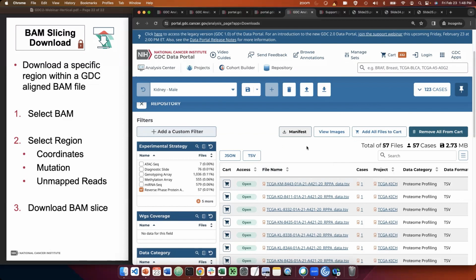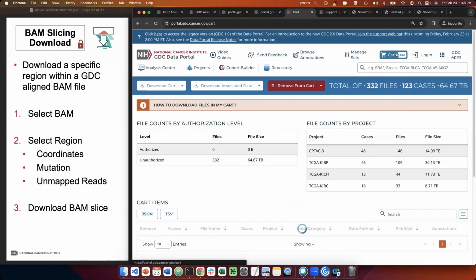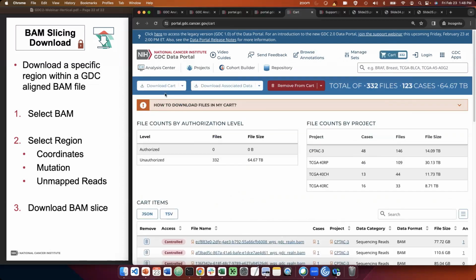I'm not sure however you would like to analyze them, or what that would require, but all of the metadata that you would need, you could also download from the cart page, like I showed before. So if you were to click on cart, all of the metadata and such would be available here. You wouldn't have to design any API calls or anything like that. You would just go down to download this stuff, and you would have it on your machine.